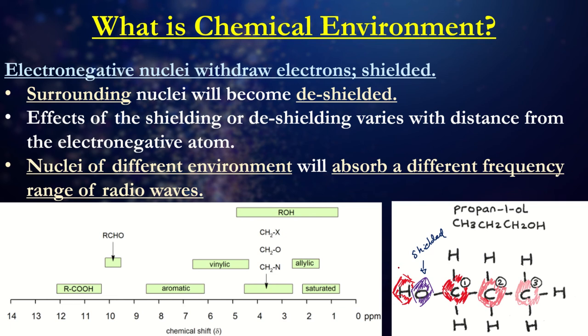That's going to go through a de-shielding effect, as the electrons are being pulled away. But what you can actually see here, as those carbons go further and further away from this oxygen, that effect gets gradually smaller and smaller. And so that's also why we see such vast ranges of chemical shifts depending on the types of bonds and interactions of the molecule available.